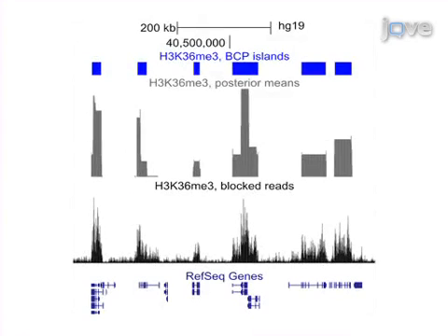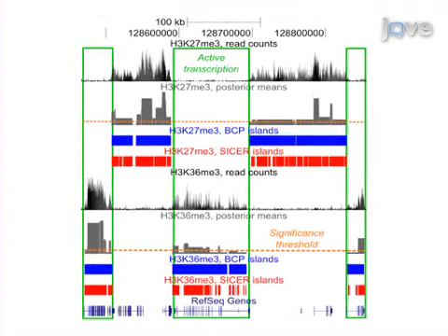Next, posterior mean density estimates of each block are evaluated for significance based on whether or not it exceeds the 90th quantile with respect to the input control background density in order to generate the final enriched genome segments. Results are obtained that illustrate the progression from raw sequenced reads to posterior mean read density estimates, and finally enriched islands on ChIPseq data during BCP analysis.